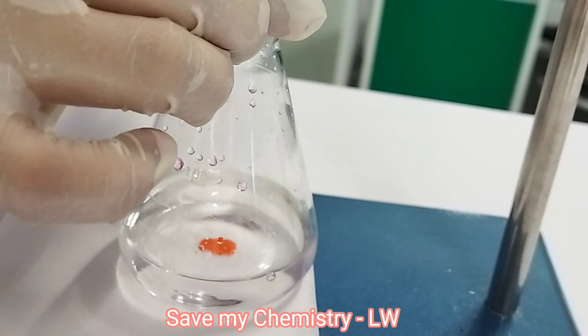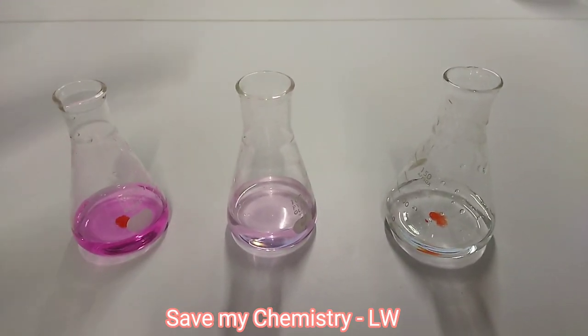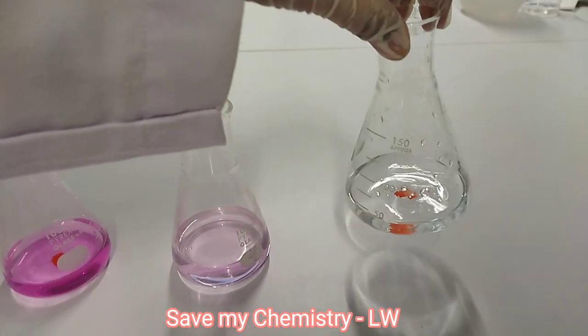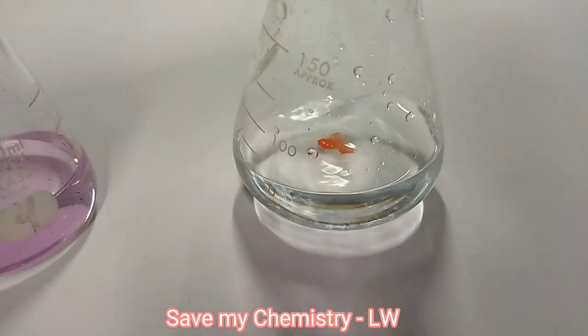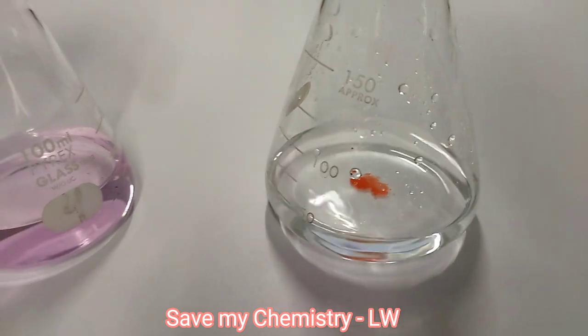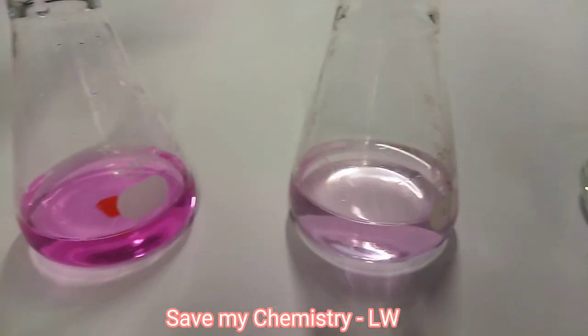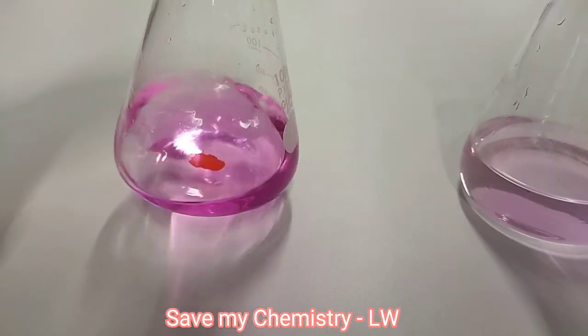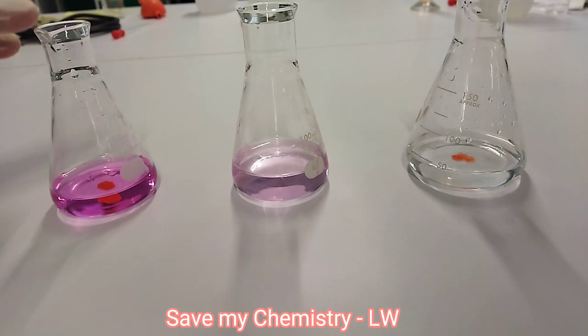If we continue to titrate, you will have the end point and the color will be darker. See the difference of those 3 colors. This is the colorless solution, the color before you titrate it, or it has not reached the equivalent point. This is the right color. You have reached the equivalent point, and this is the endpoint color because you continued to titrate and the color became darker.